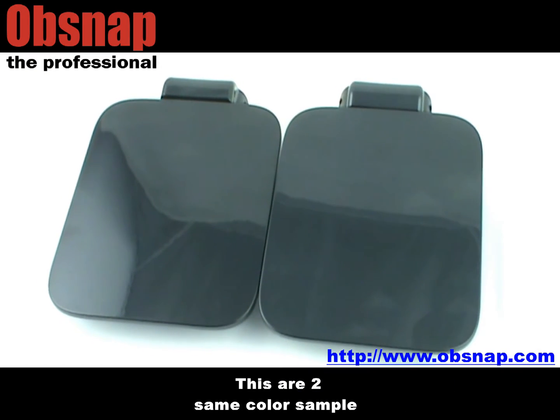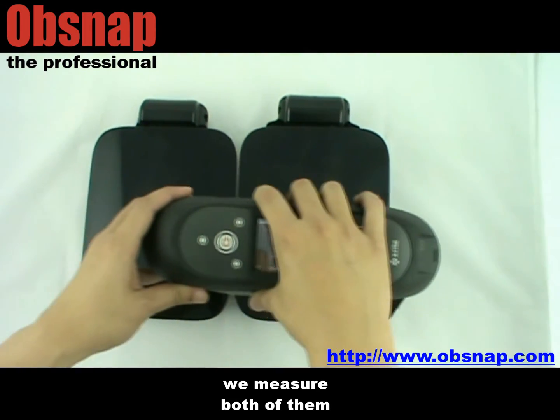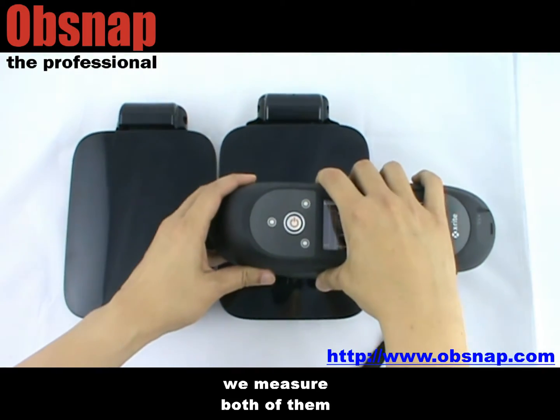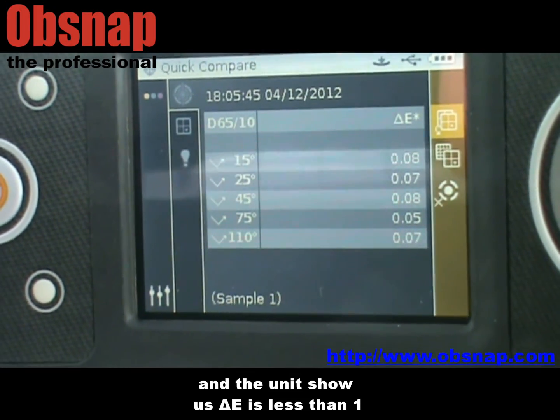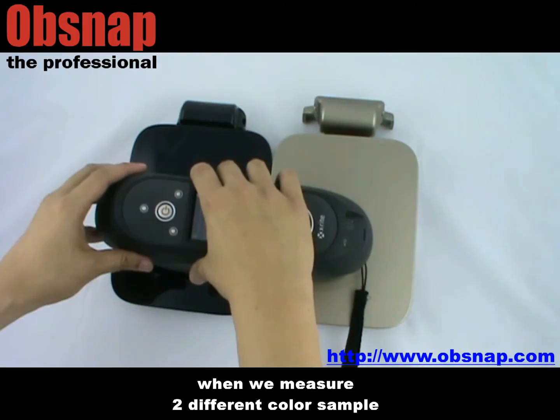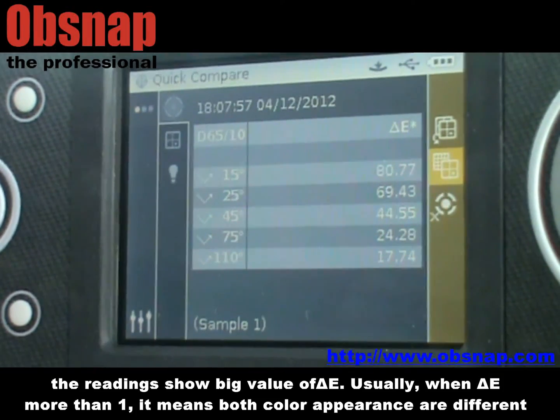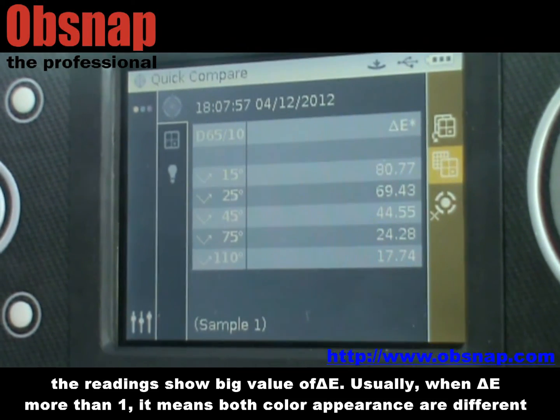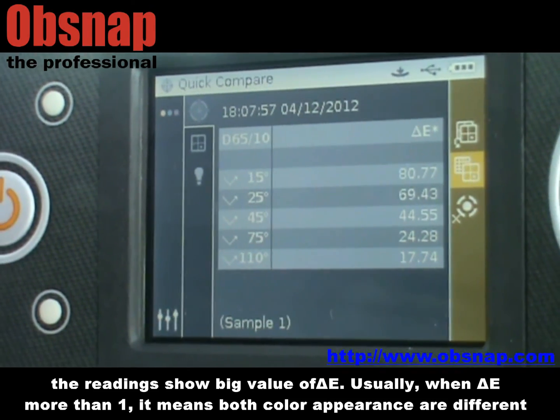These are the two same color samples. We measure both of the samples, and the unit shows us delta E is less than 1. When we measure two different color samples, the readings show a big value of delta E. Usually, when delta E is more than 1, it means both color appearances are different.